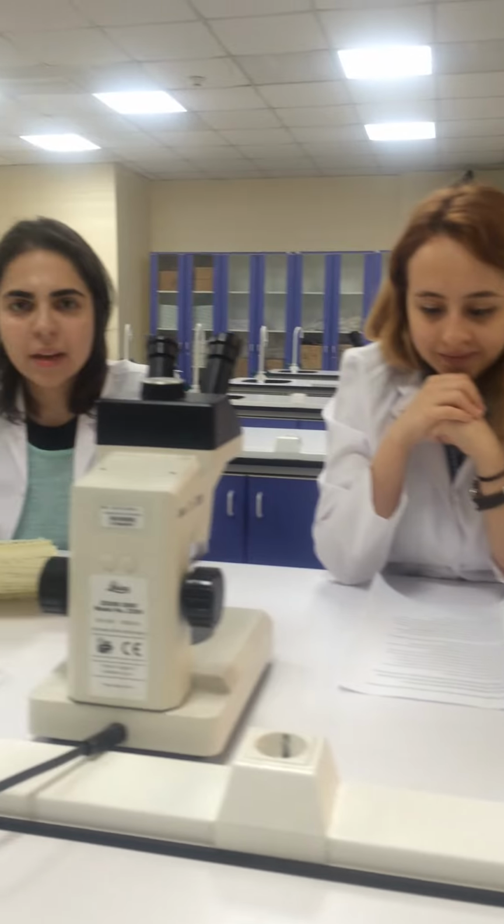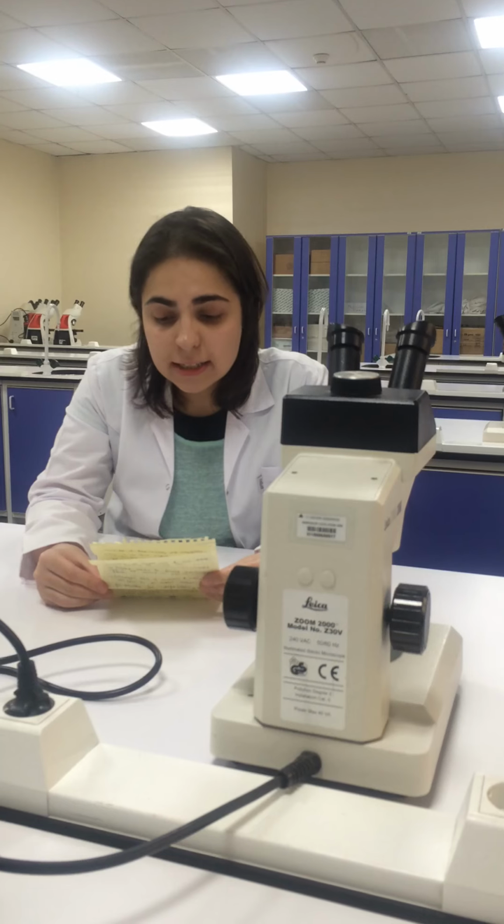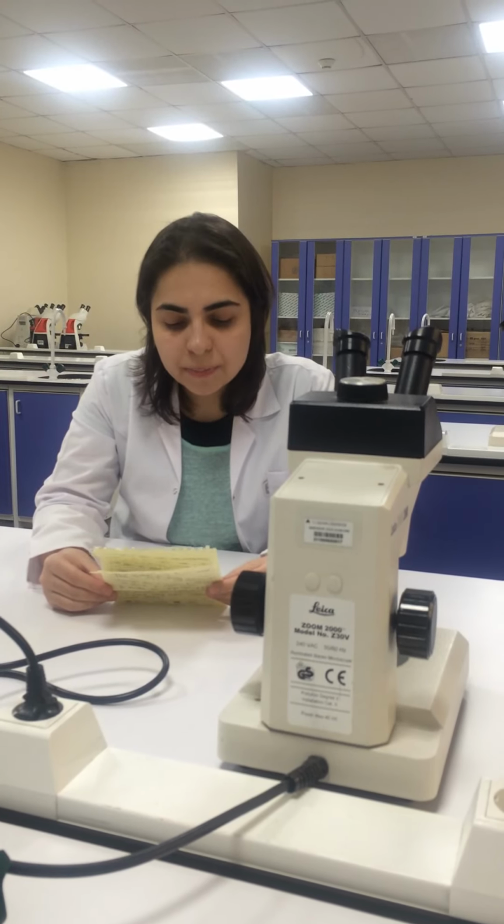Thank you. Hello, in this experiment, subcutaneous adipose tissue from porcine is used in 60 gram. All steps are done at room temperature unless it is indicated. First step is preparation of digestion medium.